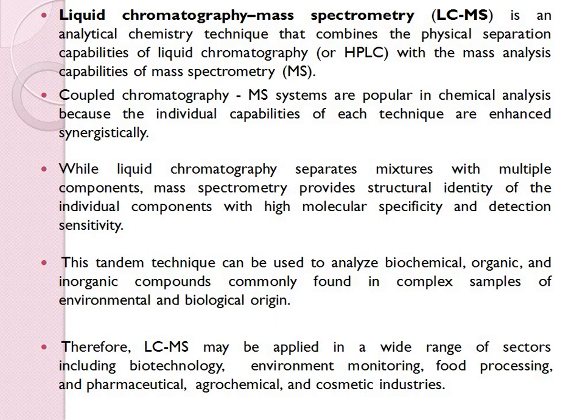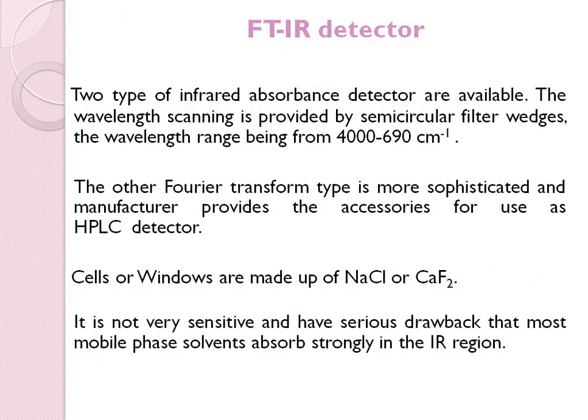This tandem technique can be used to analyze biochemical, organic or inorganic compounds commonly found in complex samples of environmental and biological origin. Therefore, LCMS may be applied in a wide range of sectors such as biotechnology, environmental monitoring, food processing and pharmaceuticals, and the agrochemical or cosmetic industry. Next is the FTIR detector.